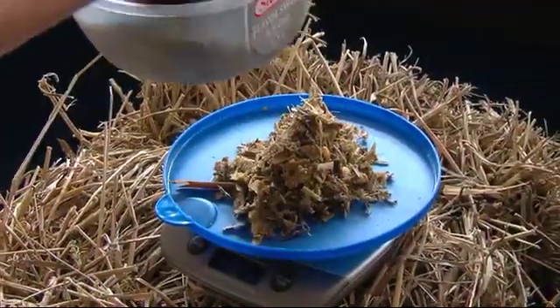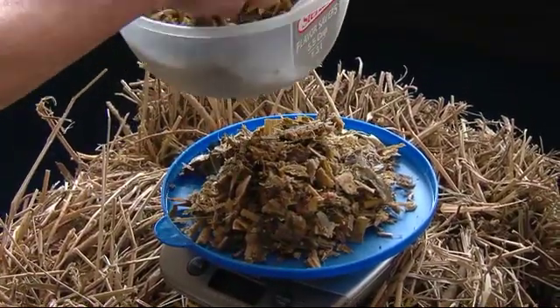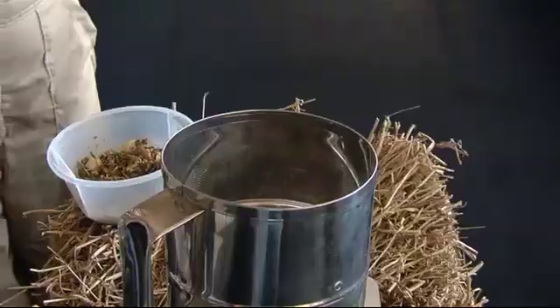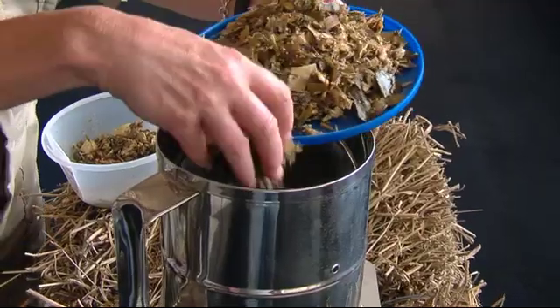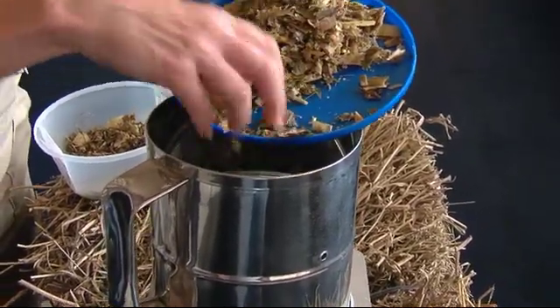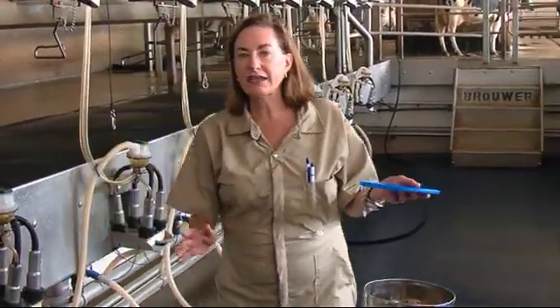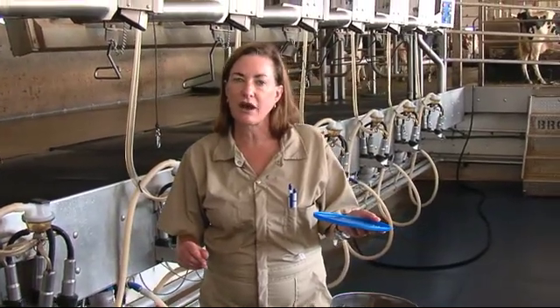The procedure is this: you take a fresh sample of your product, weigh out about 100 grams, and then you simply put it into the Koster oven, turn the oven on, and you leave it to dry down. The drying down, of course, will be determined by how much moisture is in the product.